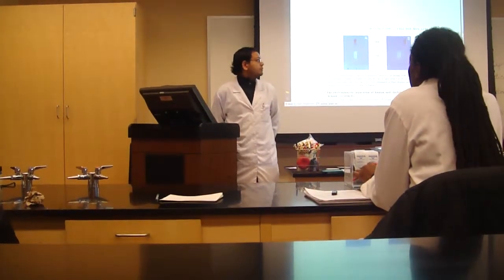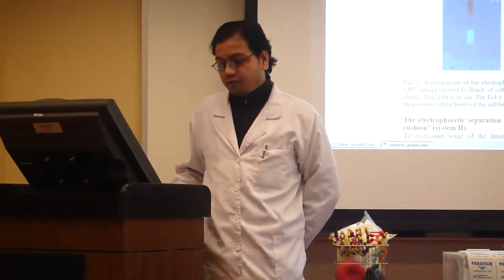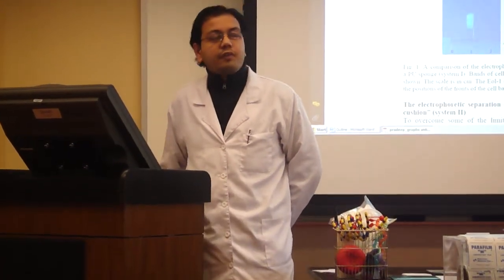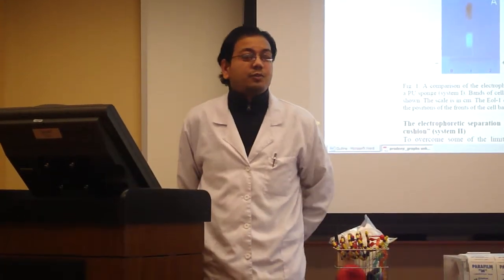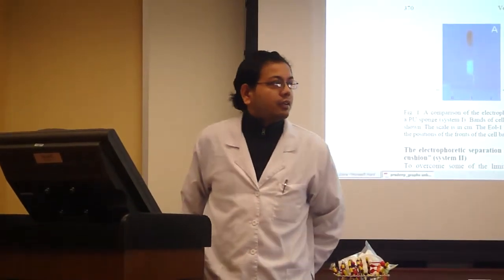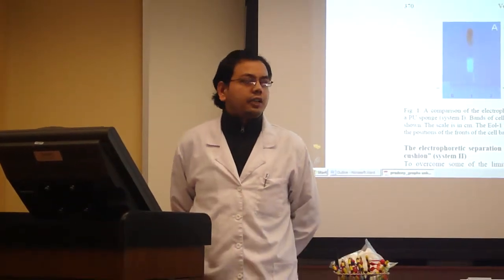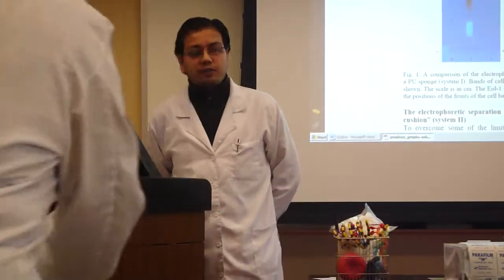Hi friends, hi all. Today I have got the topic of electrophoresis. Basically, in our previous last class, we did the electrophoresis of the protein. You see how the protein moves to their respective electrodes with their respective charge on them. But I'm here talking about the cell electrophoresis.